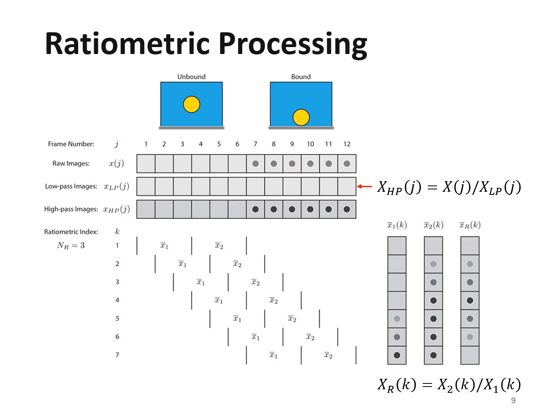In this experiment, it is important to identify and reduce background noise. To do this, we use changes in the image over time to remove the static background, which helps us see small short-term signals more clearly. First, we create a low-pass image by applying Gaussian blur to the original image.